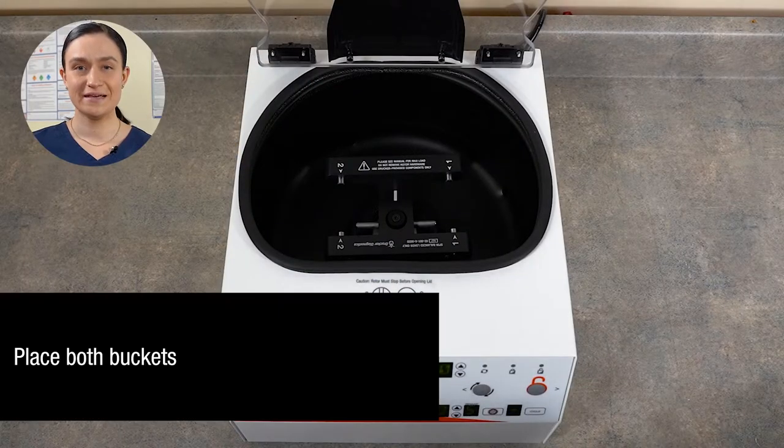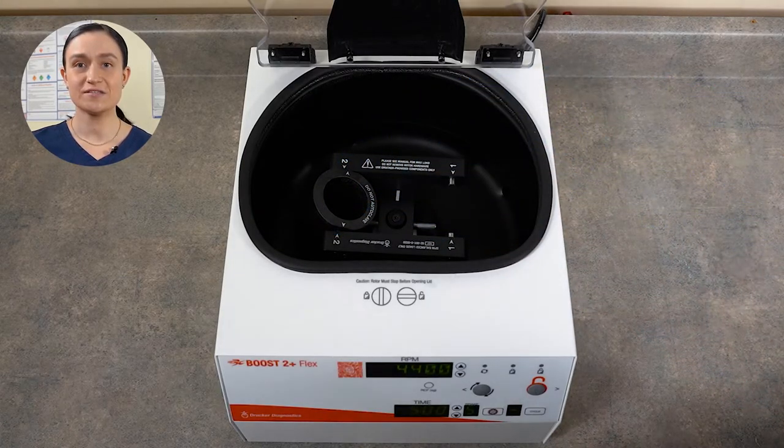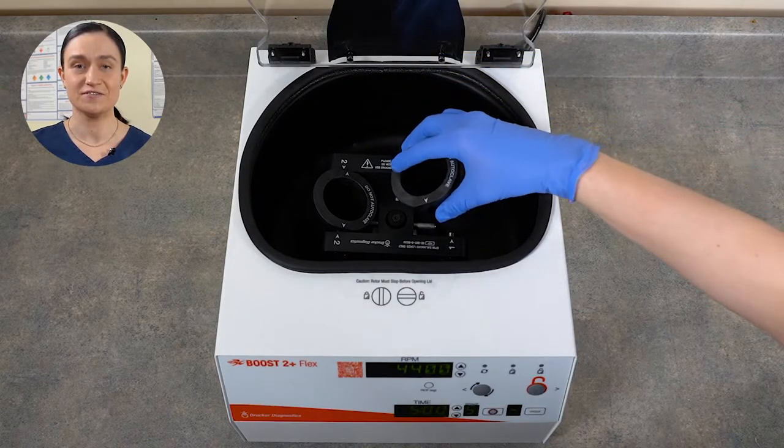Step one: make sure that both buckets are loaded in your Boost 2 Plus Flex. These buckets do not snap or click into place, but simply rest on the pins in the centrifuge rotor.